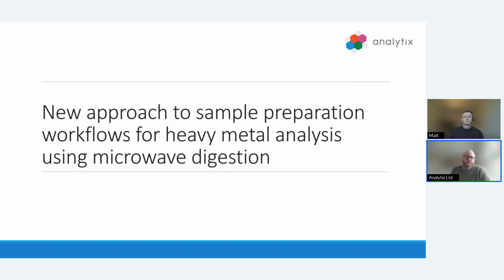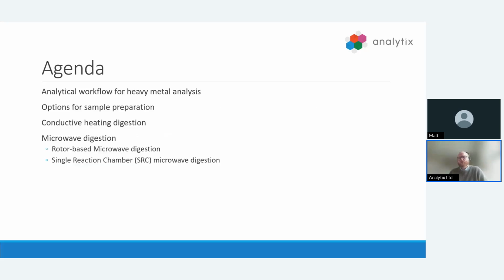Thank you all for joining this morning. Today, I'm going to be covering a webinar on new approaches to sample preparation workflows for heavy metal analysis, particularly focusing on microwave digestion. In today's agenda, I will start by covering the analytical workflow for heavy metal analysis, and then cover some of the options for sample preparations for this analytical technique and some considerations that need to be taken into account when choosing an appropriate technique.